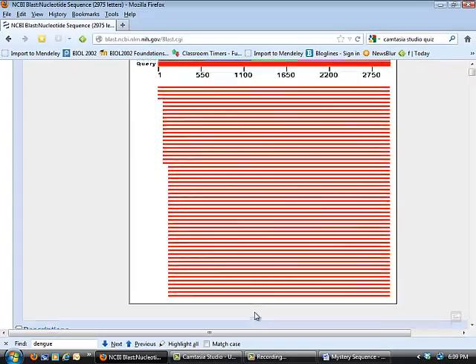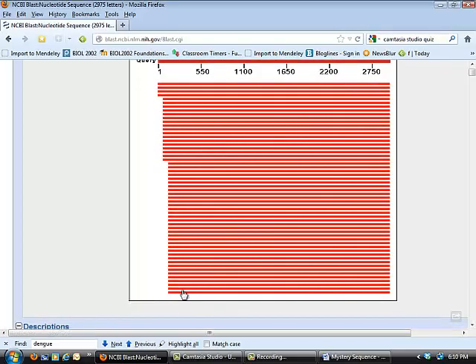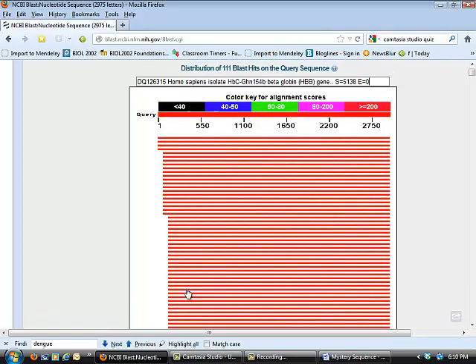One is that multiple people did experiments. Some people sequenced the whole genome. Some people sequenced maybe different forms of mutant hemoglobin from people that have blood diseases or have mutated hemoglobin molecules. And also some of this is going to be from other species. So if we look carefully, let's see if we can find one. Probably one of the lower ones down here.